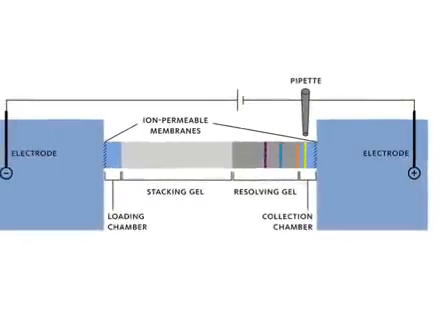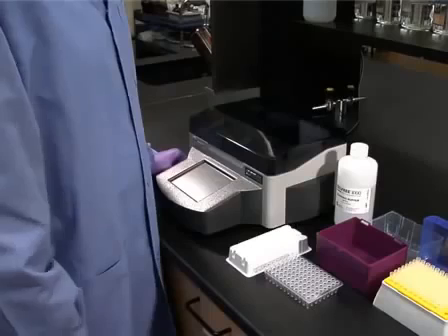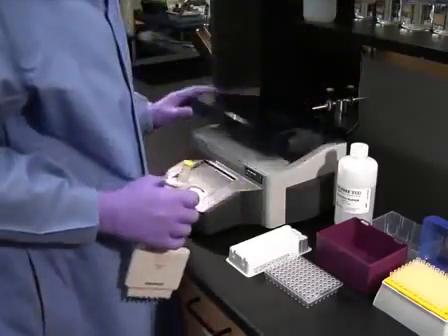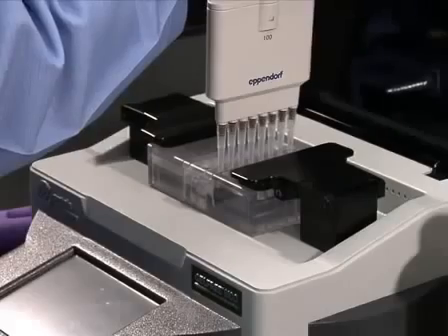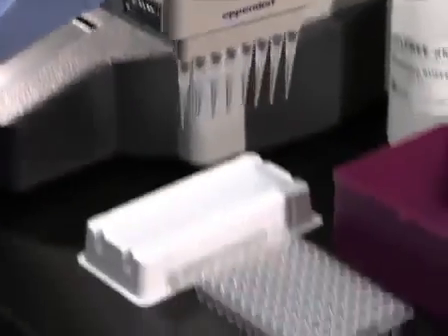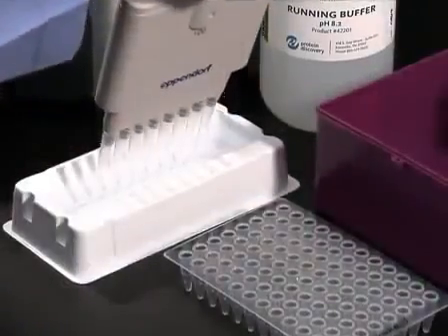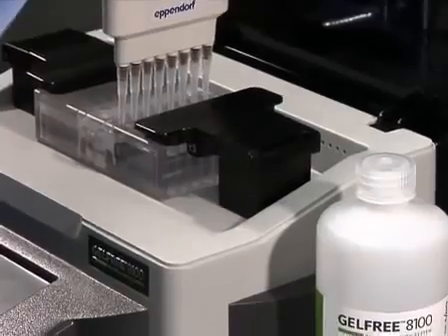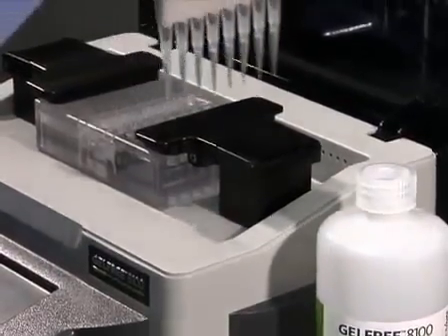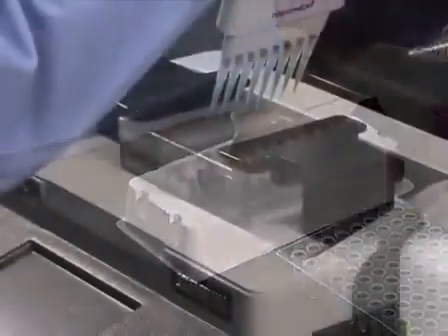Each cartridge contains 8 independent electrophoretic channels, so the user can run as many channels as they need and save the unused channels for use at a later date. To remove the fractions, open the lid of the instrument. Then, using an 8 channel pipette, transfer the 150 microliters of liquid in each of the collection chambers to collection tubes or a multi-well plate. Once the fractions have been removed, wash the collection chamber twice with gel-free running buffer by adding 100 microliters per channel and pipetting up and down twice.